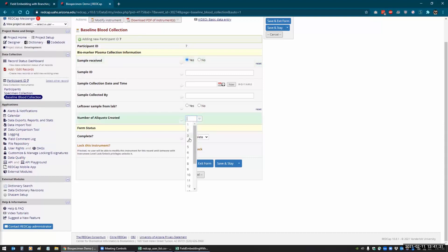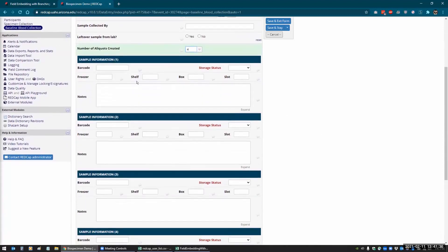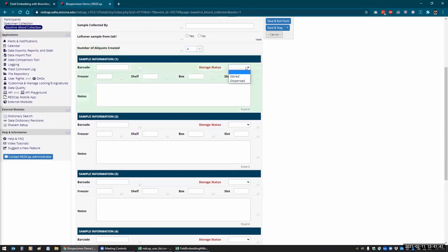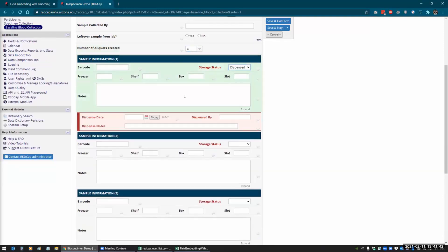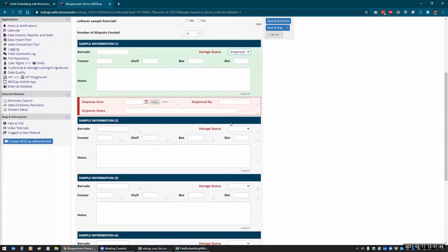I had created a dropdown here for however many specimens they collect, and then each one of these is basically its own group of fields. Depending on if it's dispensed or not, then another subgroup opens up for them for each one of these.